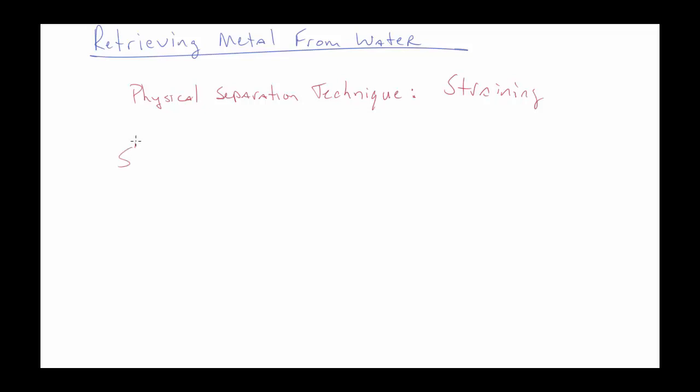I definitely want to give you a crude definition of what straining actually does. I'm not going to write it down here, but you probably want to write it down: it will remove large solids from a liquid. There definitely is a more in-depth and technical definition of straining, but for today you can leave it as it's just going to remove those pieces of metal from the liquid for us so that we can set the lab up for the next group coming after us.